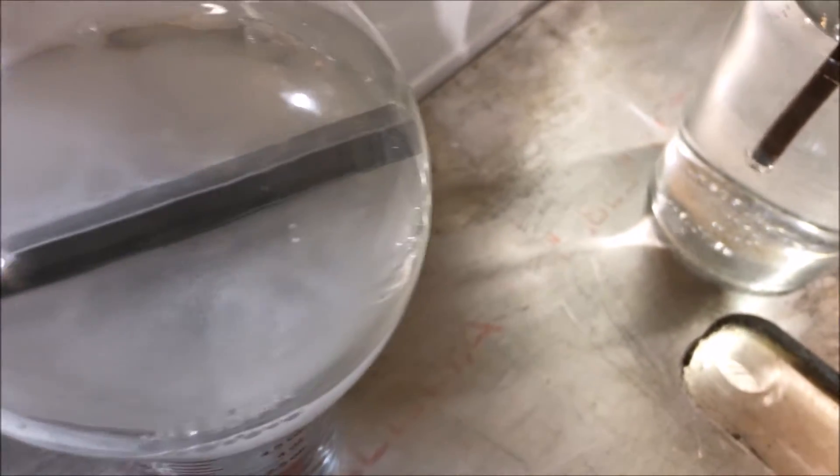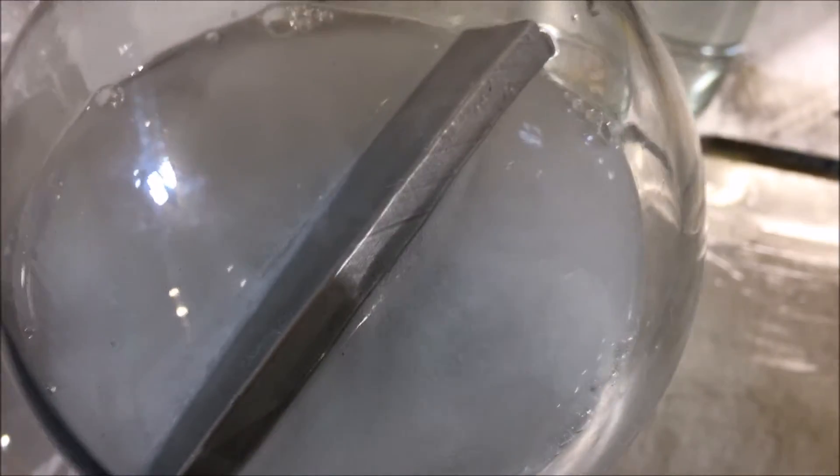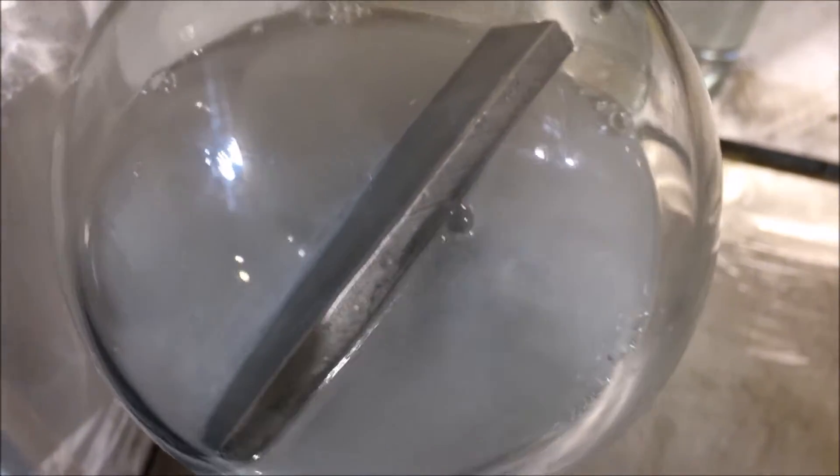After that little explosion where we lost half of the solution, I decided to go ahead and add some water to what was left over. Come to find out, it's actually reacting a little bit more violently.